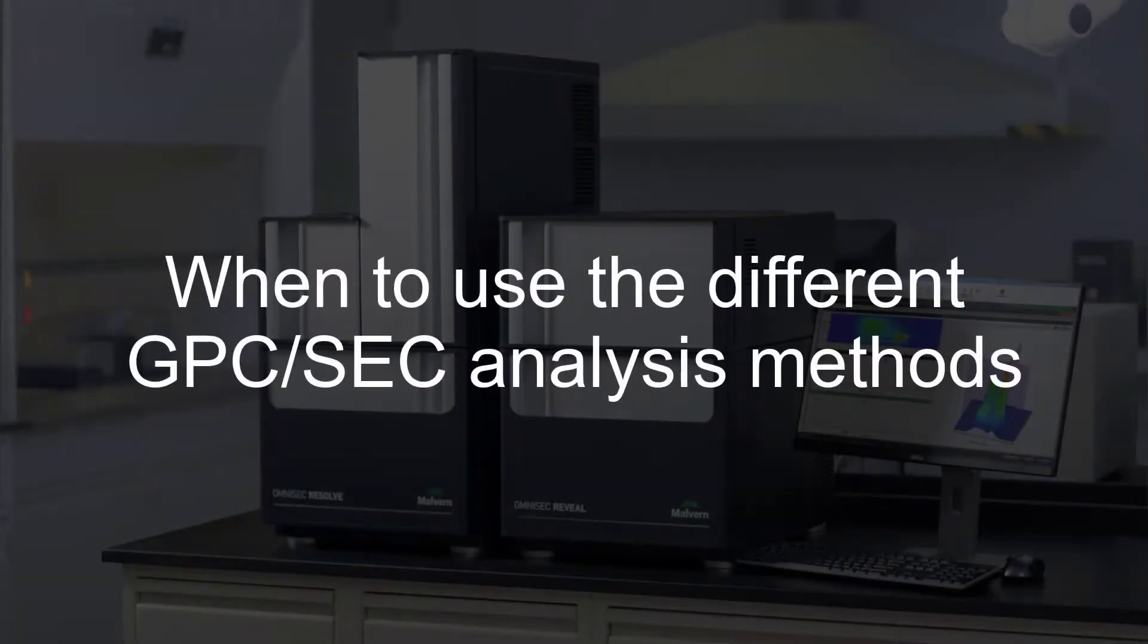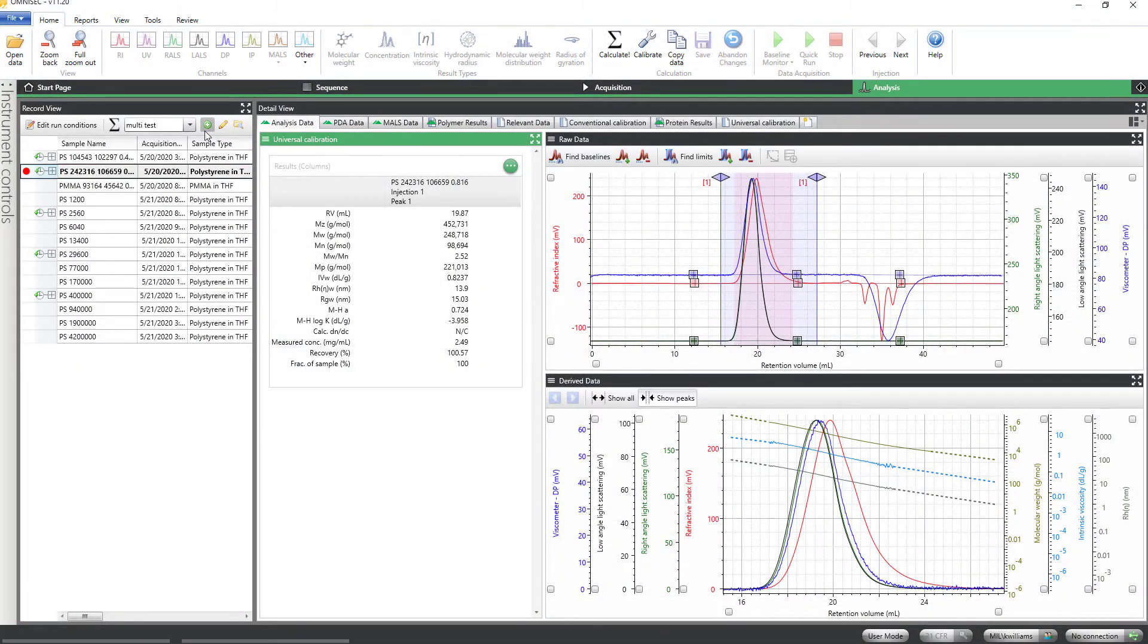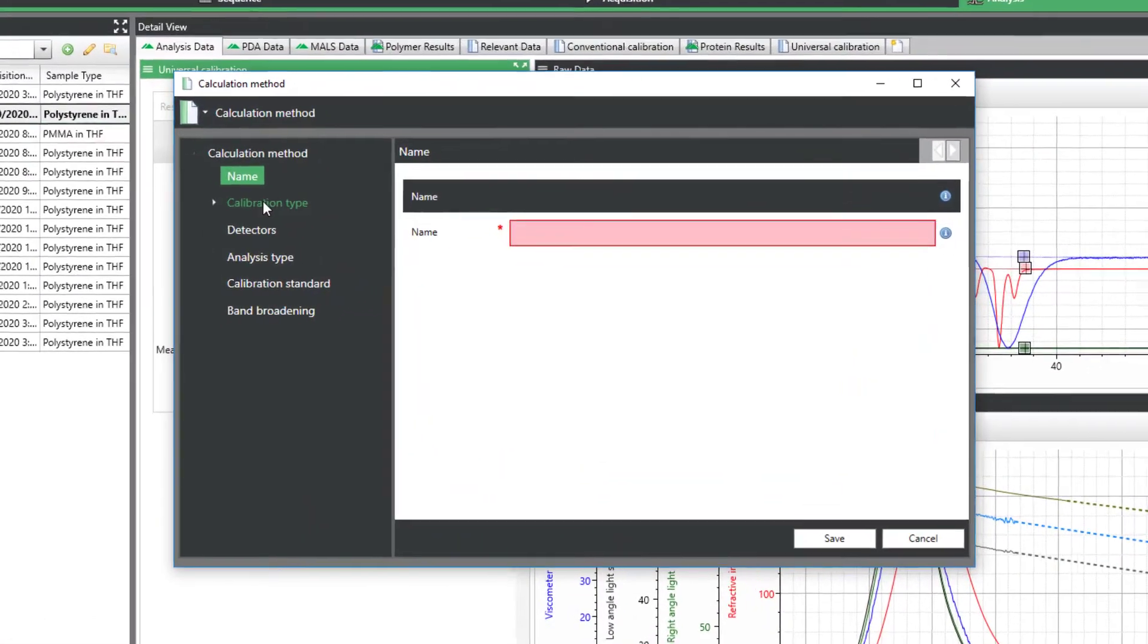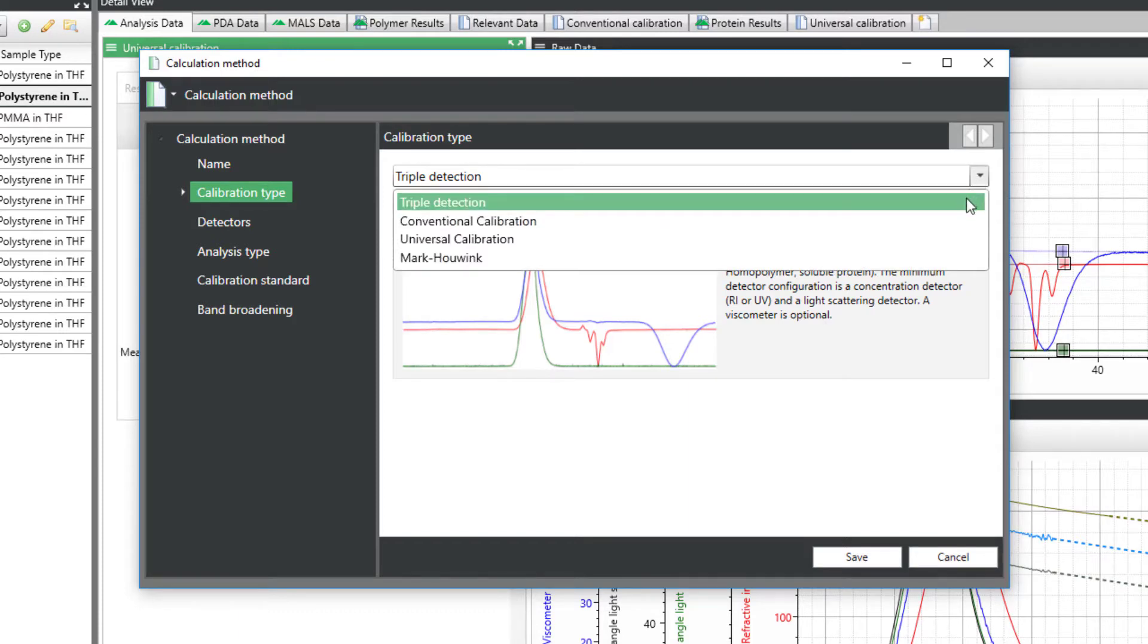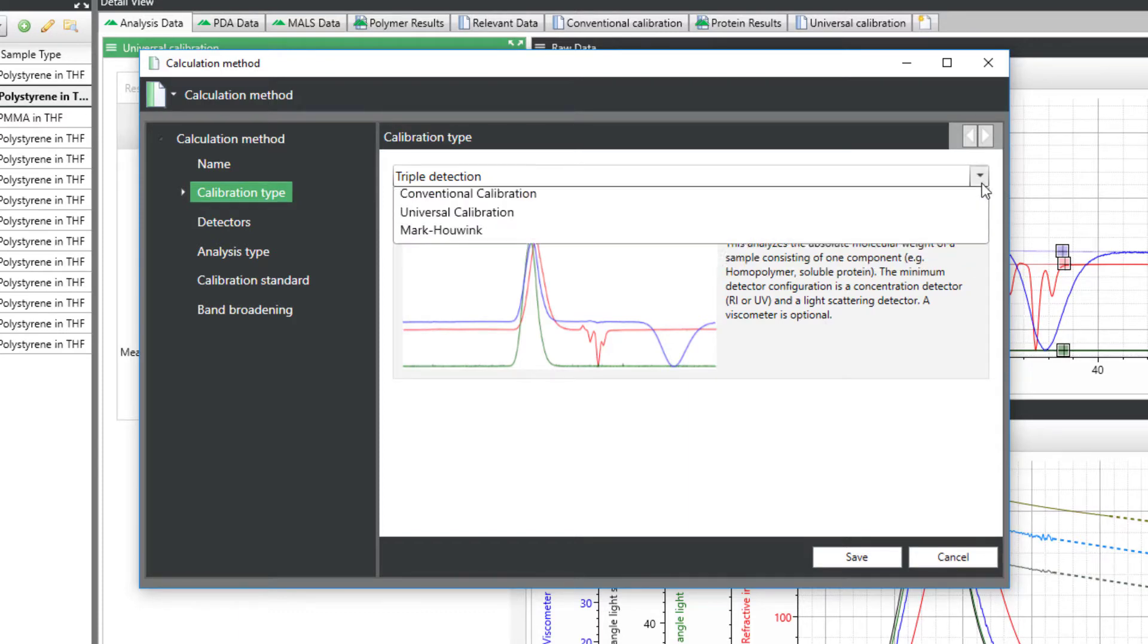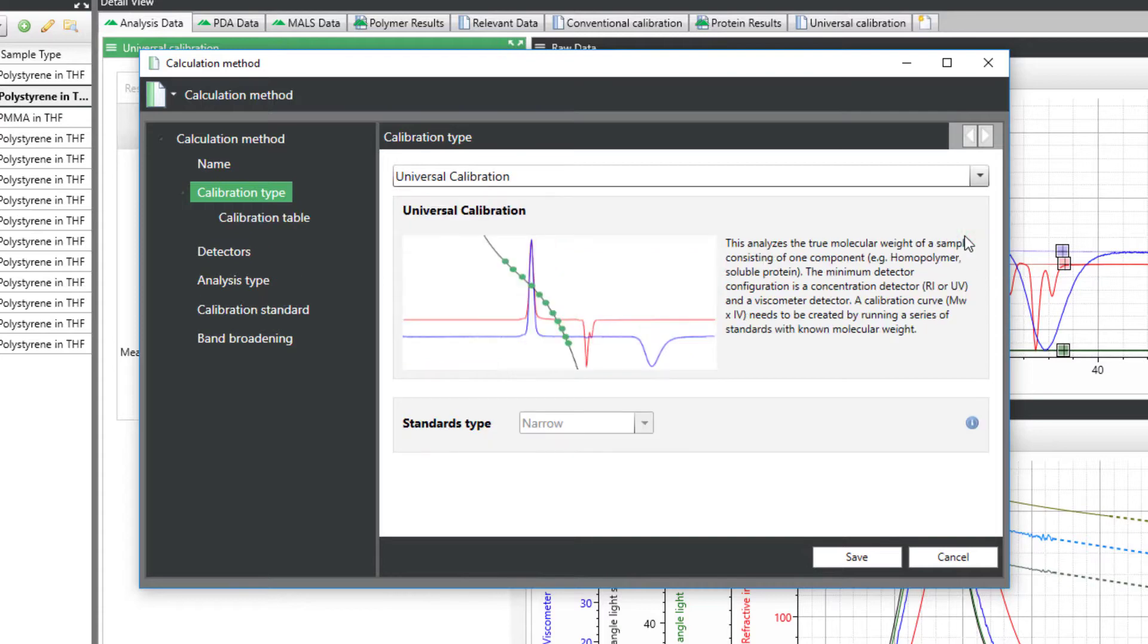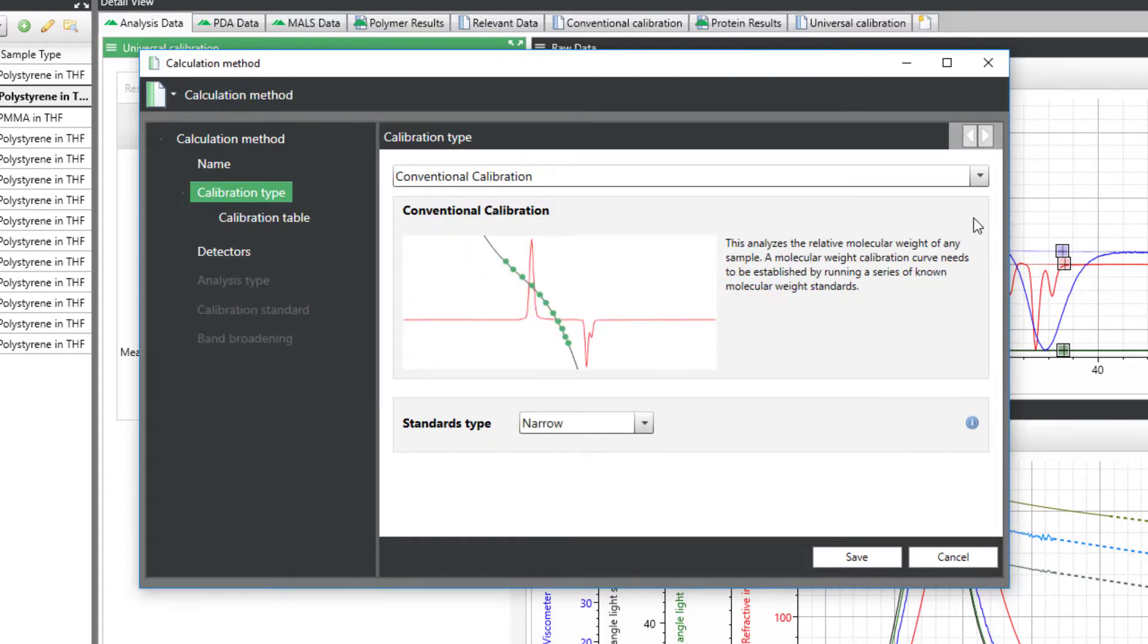When to use the different GPC/SEC analysis methods. The Omnisec software offers a variety of analysis methods or calibration types to help you get the most out of your data. These options include advanced detection or triple detection, which indicates the use of a light scattering detector, and the column calibration options Universal Calibration and Conventional Calibration.